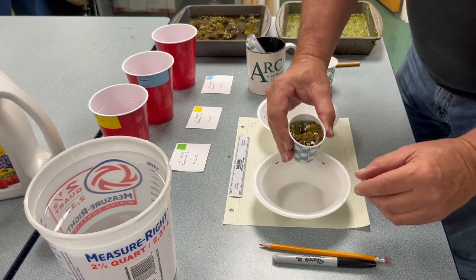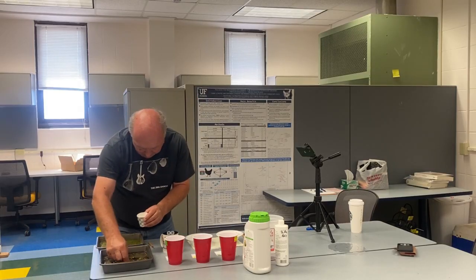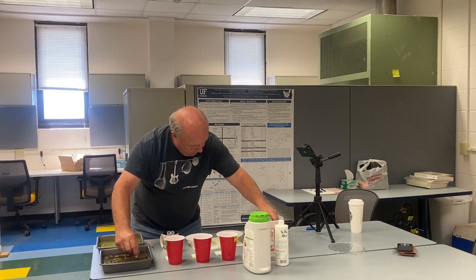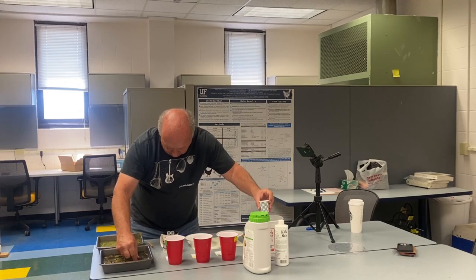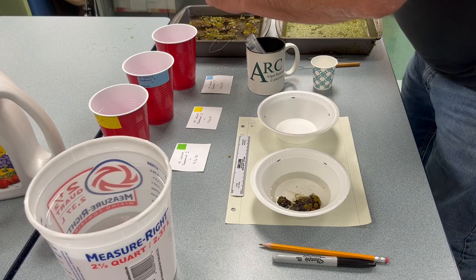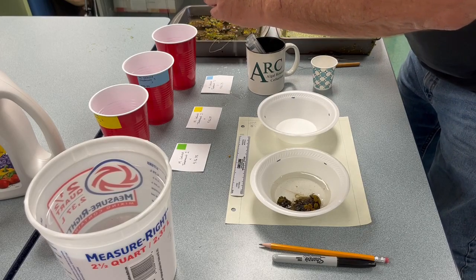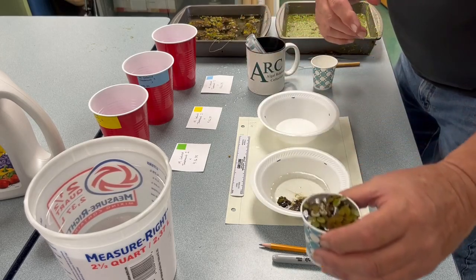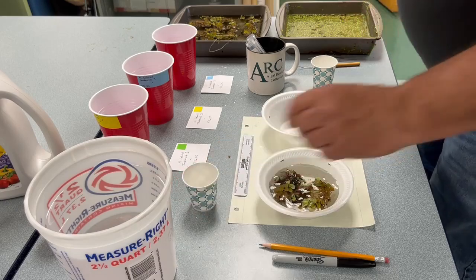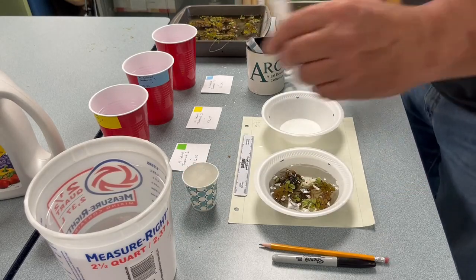We're gonna do that twice. So we'll do that once. Oops. I collected these from natural ponds. You'll probably get yours from a distributor. Okay, so another one. Put that in there. And then we're gonna do the same thing with the small and the Lemna.